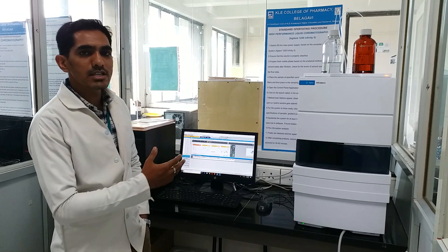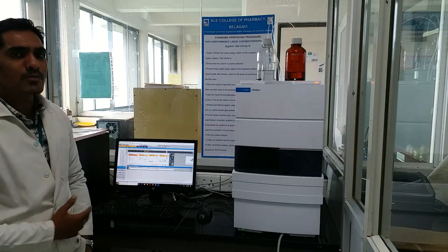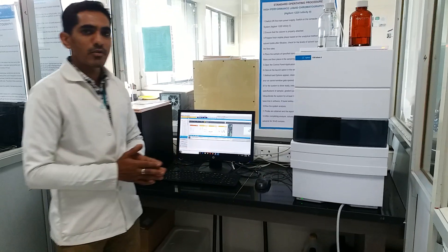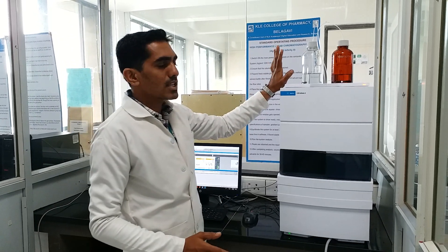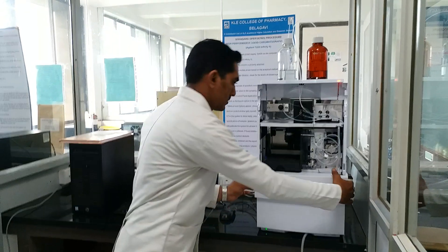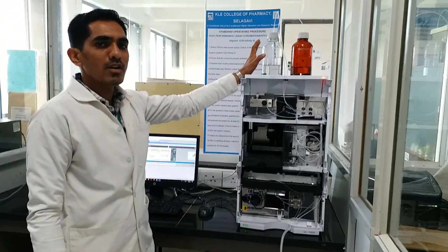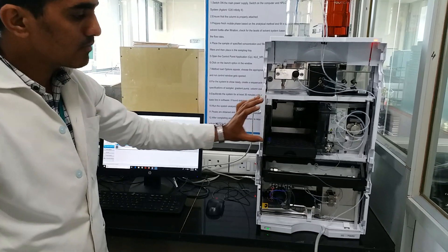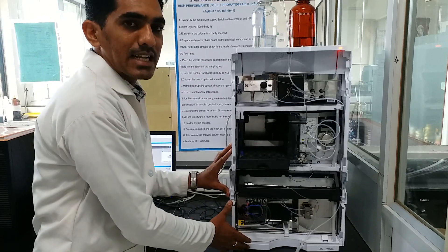Next we will move towards the major instrumentation part. In our college we have the Agilent instrument, make 1220 Infinity 2. Now we will move towards the different parts of the instrument. We have the hardware part and the software part — this hardware part is connected with the PC which has the software part. The different parts include: the solvent reservoir, the pumping system, the injector port, the column port where we keep the column system or stationary phase, and followed by the detector part.